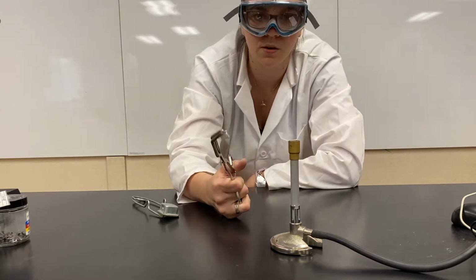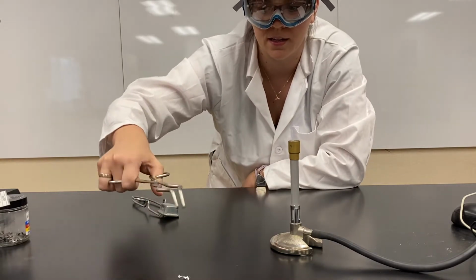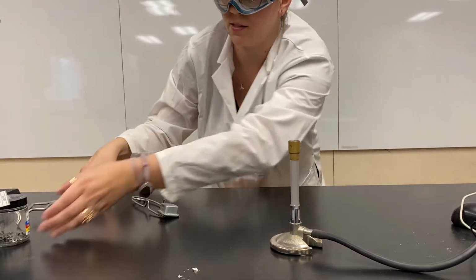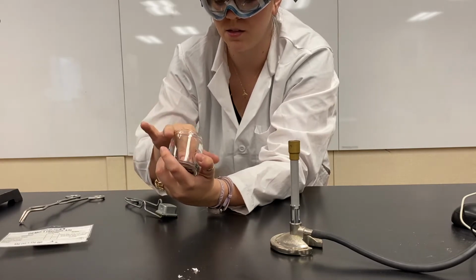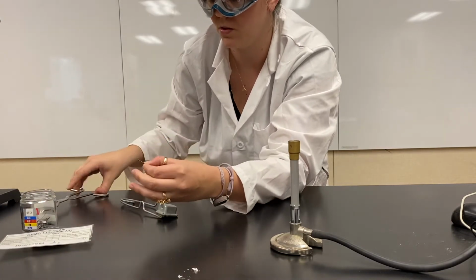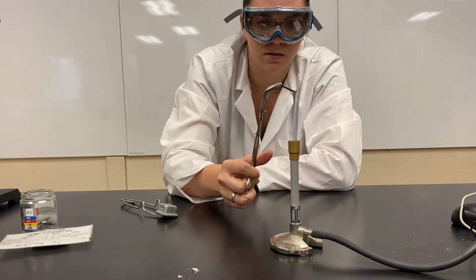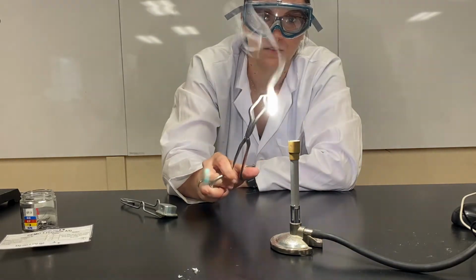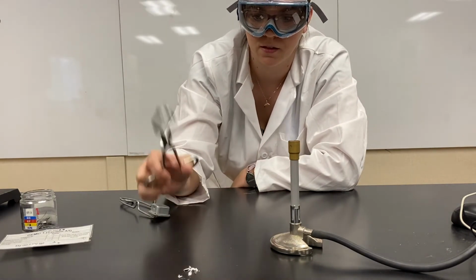Okay, so we'll look at it one more time, okay? Magnesium metal plus oxygen in the air, and I get magnesium oxide, which if you can see, is kind of like white powdery stuff. Definitely not the magnesium piece. Grab an even bigger one that I started out with, okay? So we'll look at one more of these. All right, exciting, okay? There's our first demo.